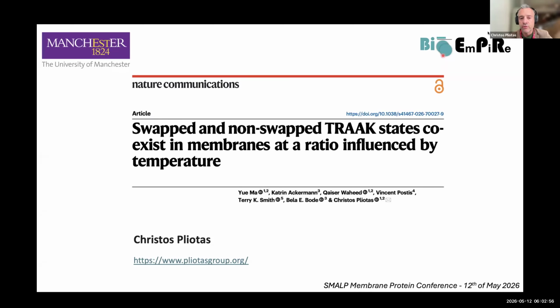I'm a group leader at the University of Manchester, and today I'm going to present to you our recent study, published a month ago in Nature Communications from our group, in which we used SMA extensively for purification of membrane proteins.